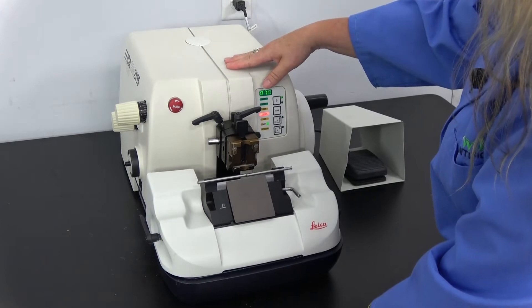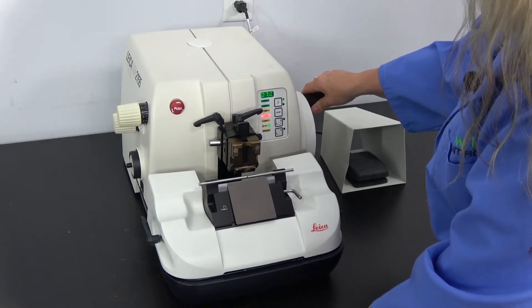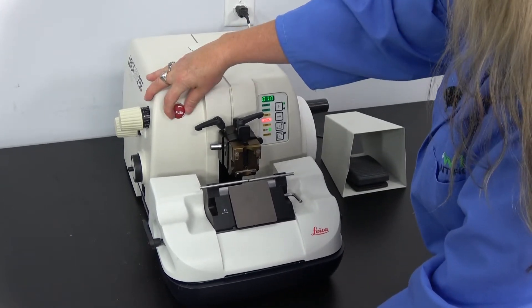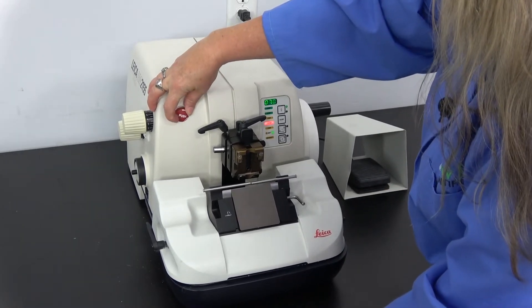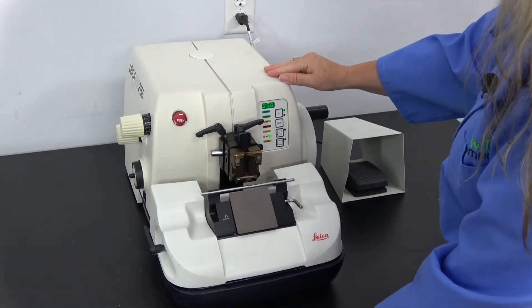Of course the emergency stop stops everything. Nothing is going to go anywhere. Pushing the foot pedal will not make it go. You want to turn it and let it go.